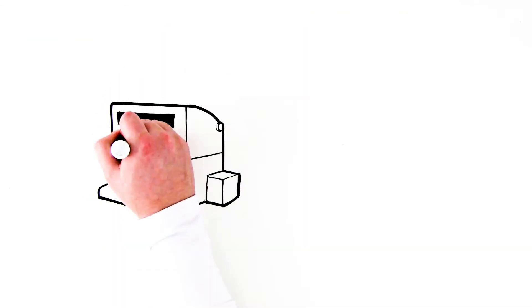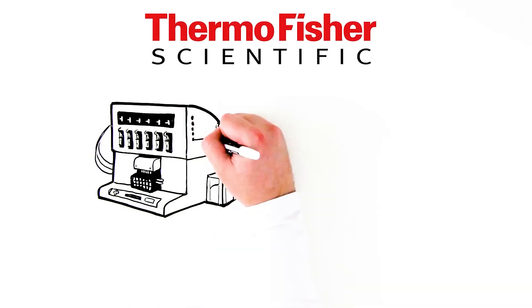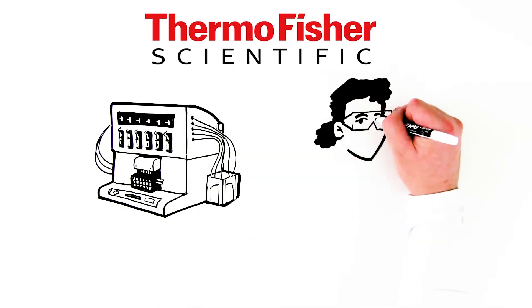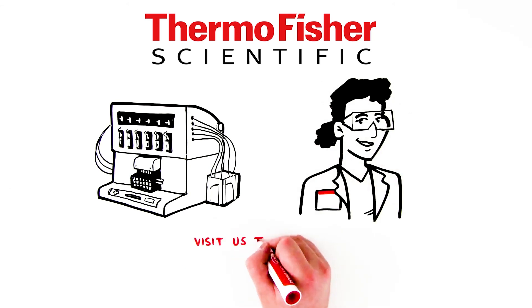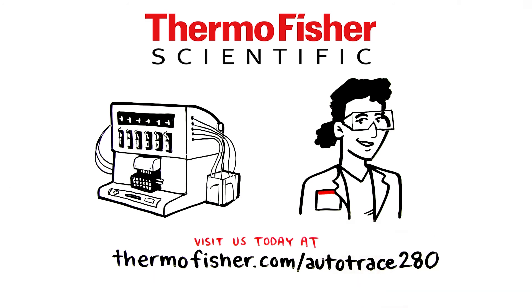To learn more about the AutoTrace 280 PFAS SPE instrument from Thermo Fisher Scientific, contact your local Thermo Fisher Scientific chromatography specialist, or visit us today at thermofisher.com/autotrace280.